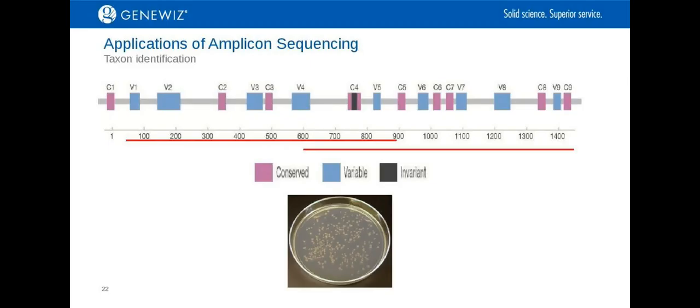The 16S gene is a highly conserved gene across all bacteria. The advantage of using this gene for identification purposes is that it contains both highly conserved regions for primer design, flanked by highly diverse regions that are specific to each taxa. Sequencing these hypervariable regions allows researchers to determine what species is present based on a reference database. One example is shown below.